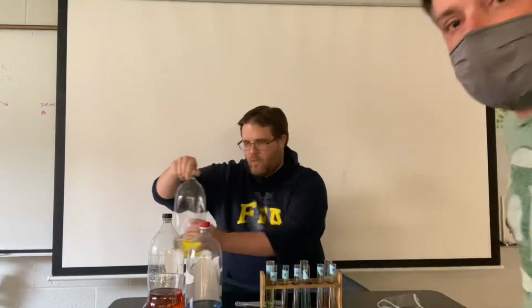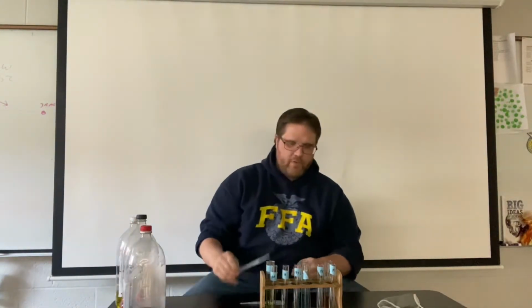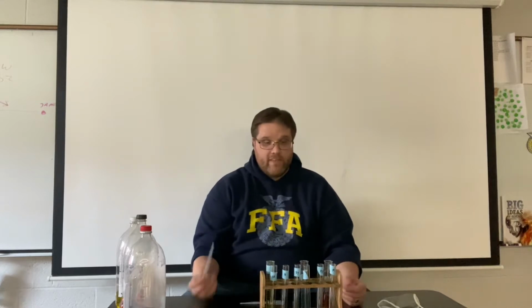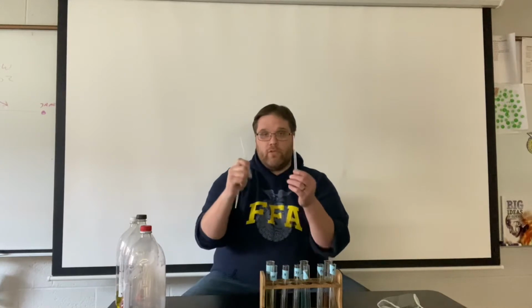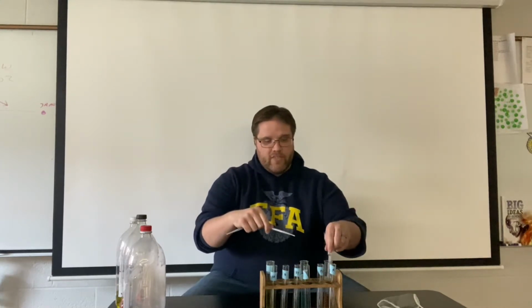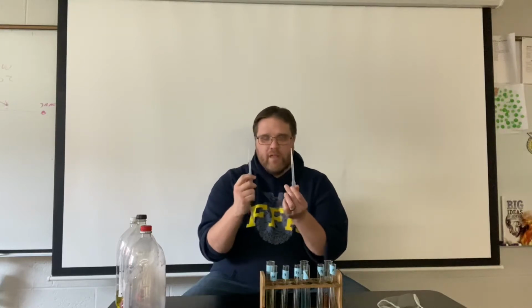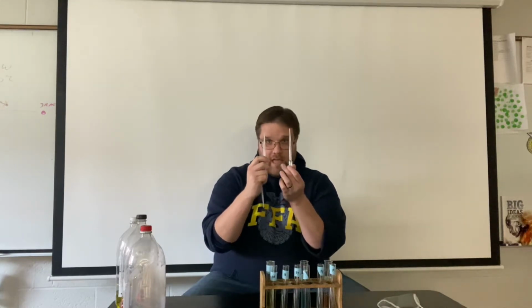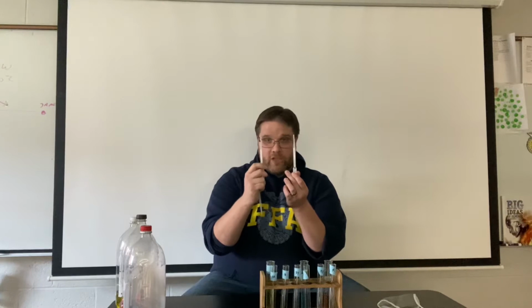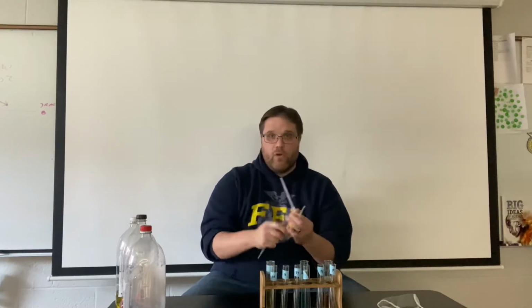Okay. And what we're going to do is move these out of the way, because we're not going to be using those pretty much from here on out. And we're going to take our pipette, and you have 3 different ones. When you do this, you might set your pipettes in there. I wouldn't recommend it because they're probably not long enough, but just make sure that you don't mix these prior to actually starting the lab. They need to be as they are for each color. So you're using 1 for each. You got 1 pipette for blue, 1 for yellow, 1 for red.